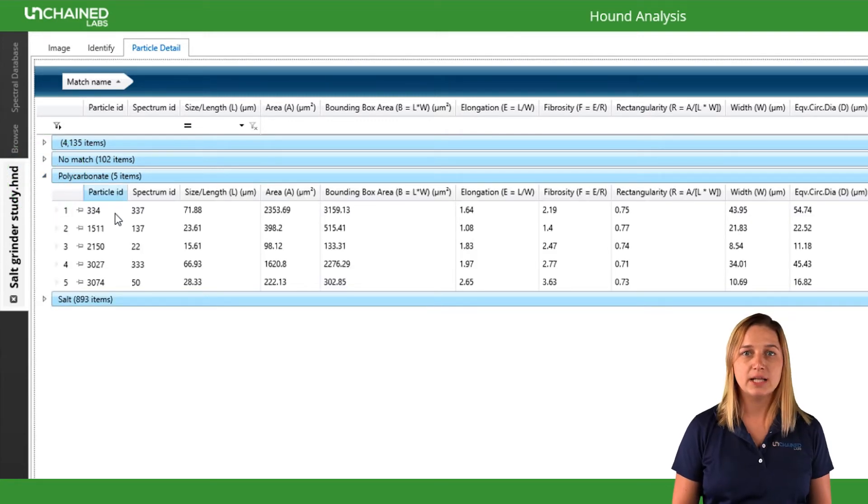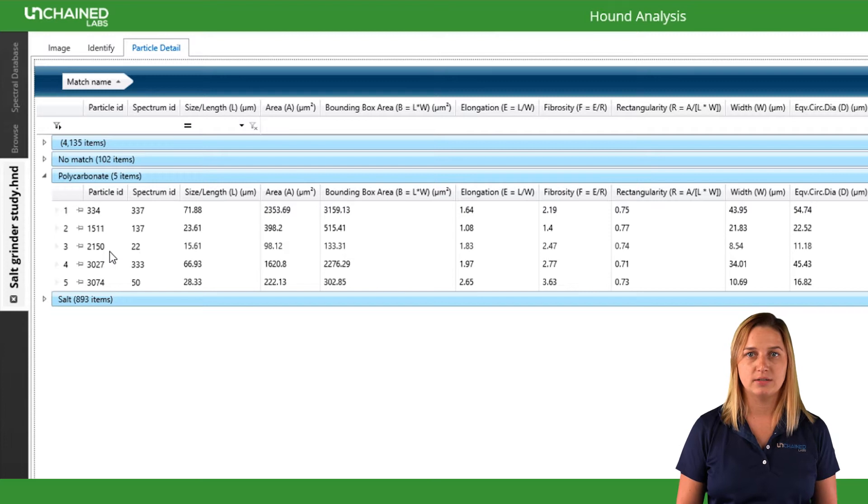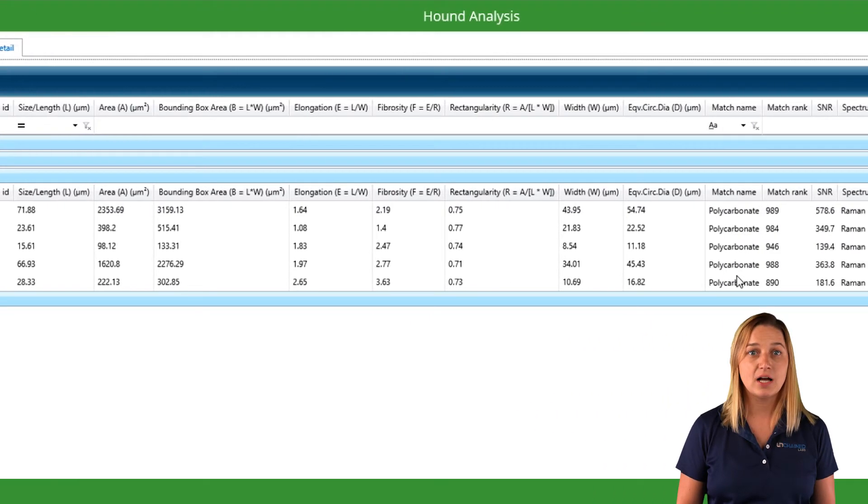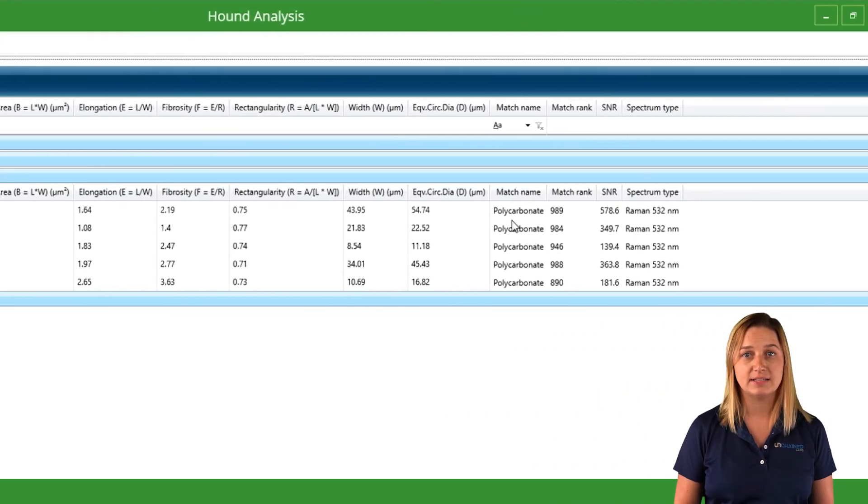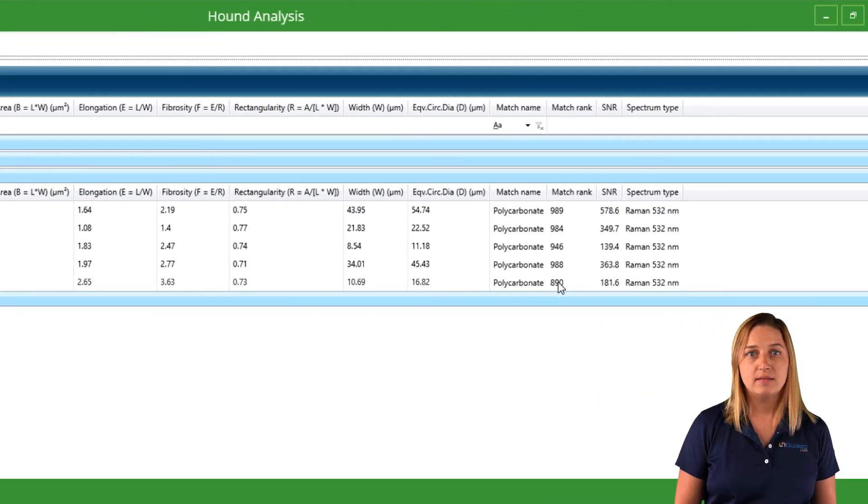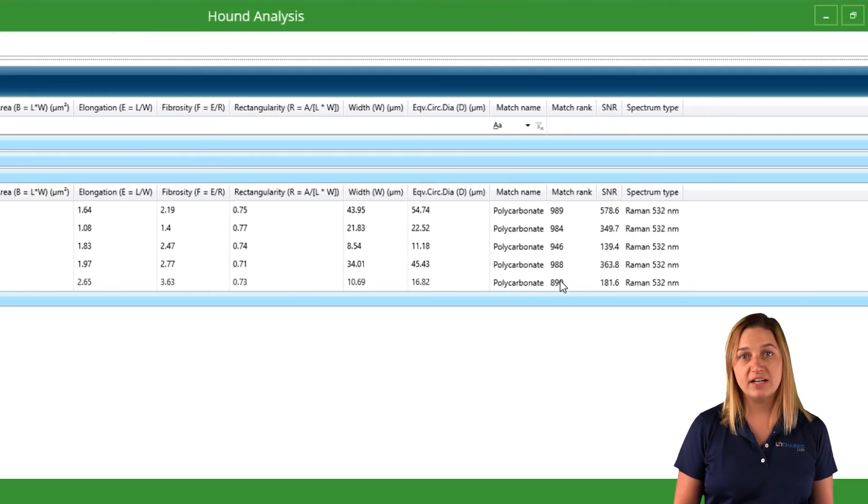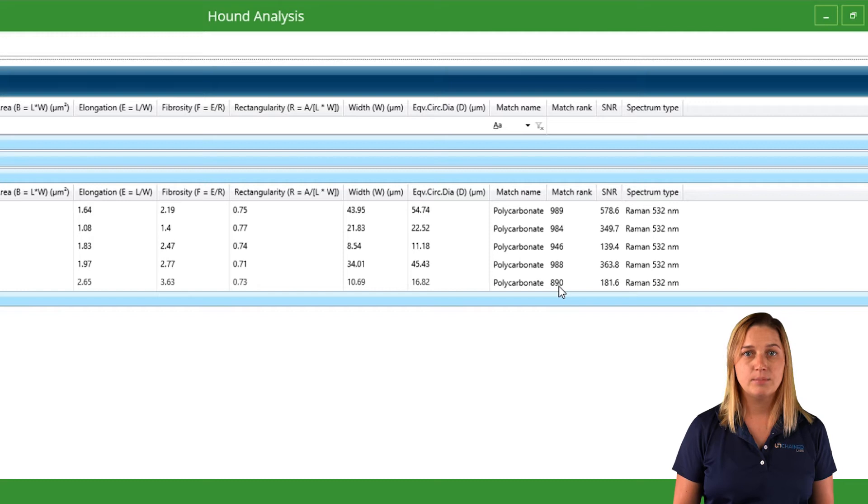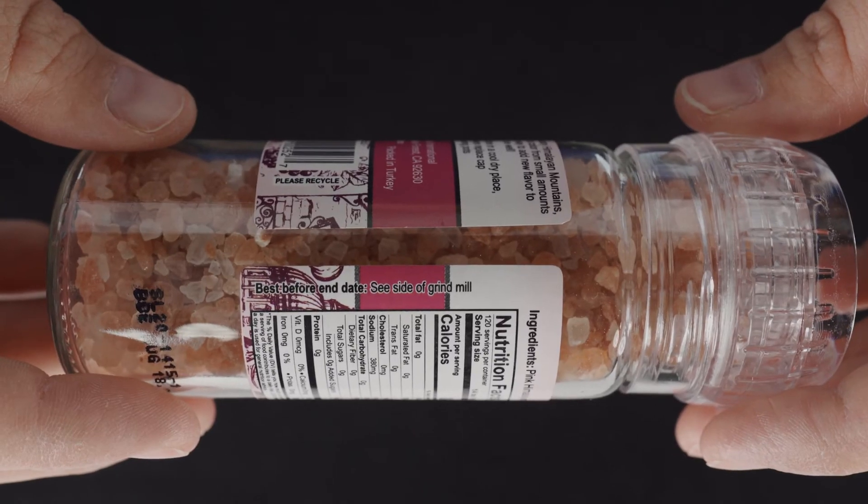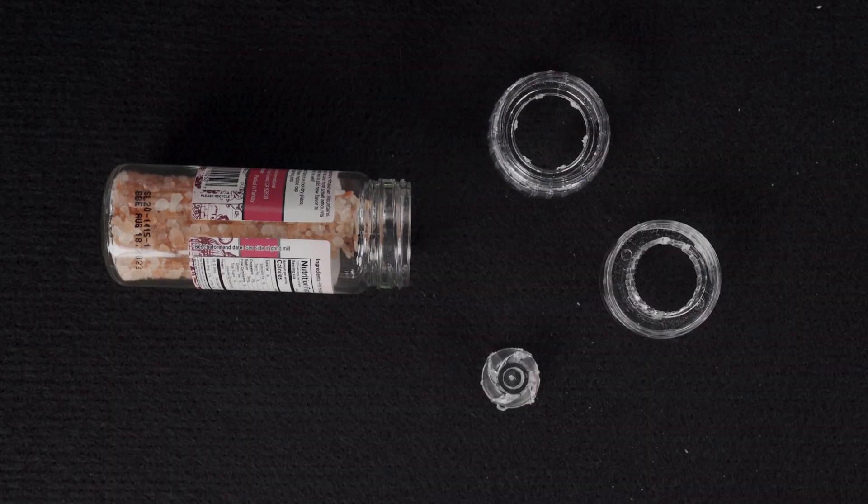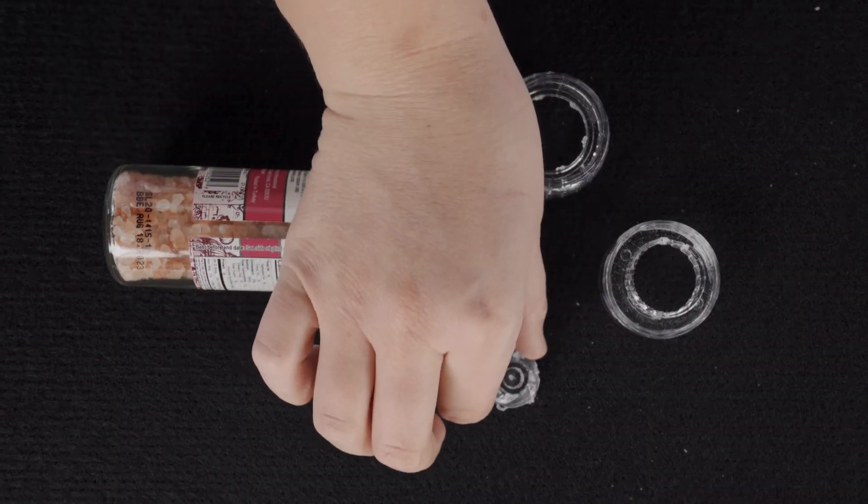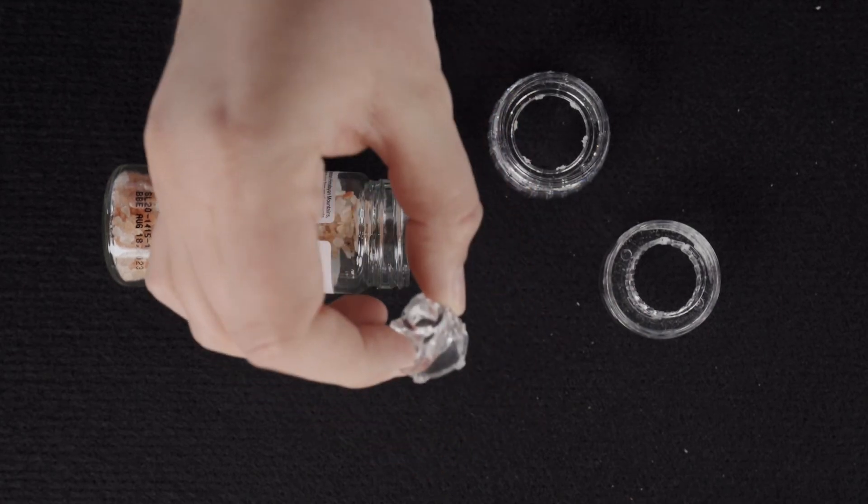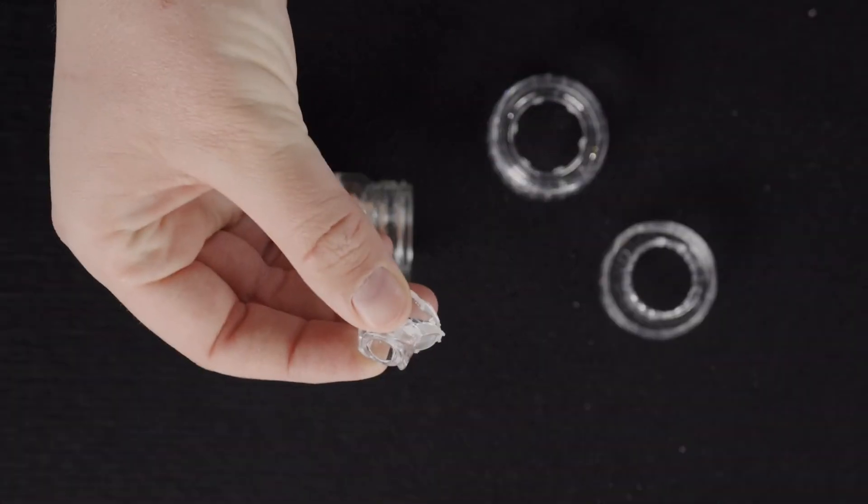Here we see a bunch of polycarbonate particles. This is a common type of plastic. This grinder is made of plastic, but are the particles coming from the grinding mechanism itself? Let's take the actual grinding mechanism out of here to see if it's the same polycarbonate as the microplastics we just found in our salt.